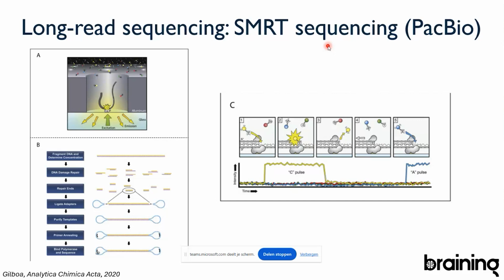However, maybe in the second time, so it's a loop, so at some point it will come back to the same place. Maybe in the second time it will include the right one, and in the third time as well, because it will make another mistake at another place, but rather not at the same place. And so because you're sequencing the same molecule over and over again, you reduce the margin of error that you would have compared to if you would do the amplification only one time.